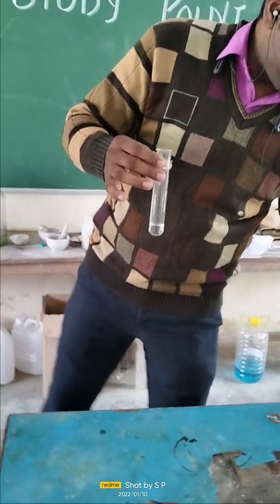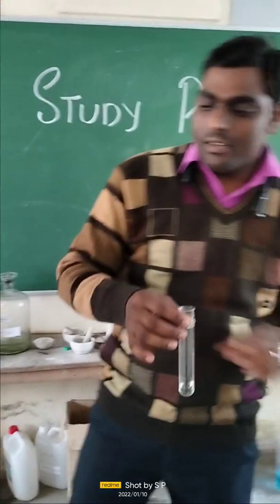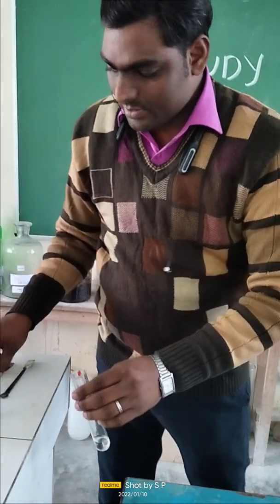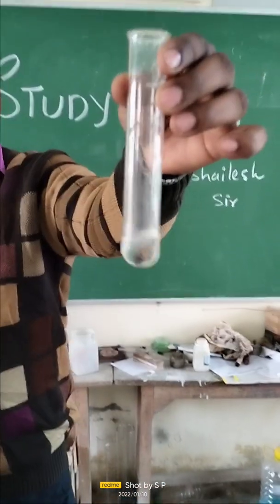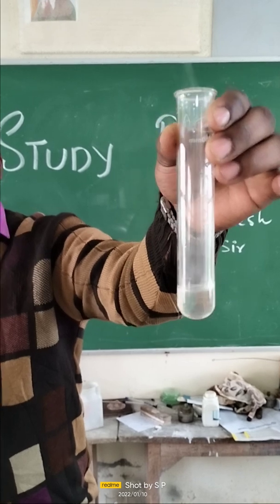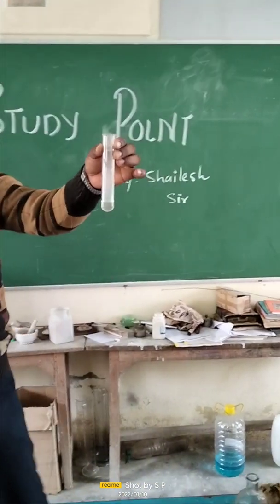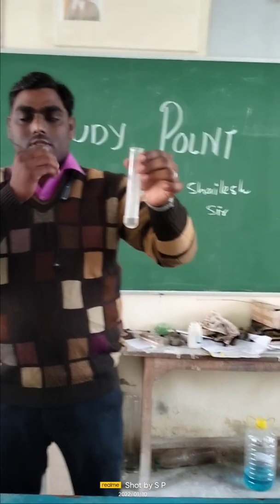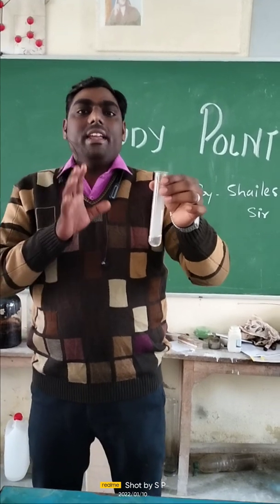Now for another experiment — this is dilute sulphuric acid and I am going to react this sodium metal with sulphuric acid. Just see what reactions are going to be performed. Sodium metal is very reactive, so this reaction is vigorous with the evolution of hydrogen gas. Just see, small flames are also produced. This is a very dangerous experiment — do not try to perform it by yourself. I am showing you how the reactivity of sodium is very high and it should be used very carefully.